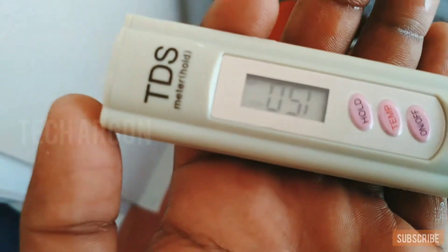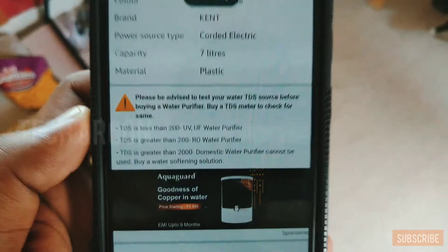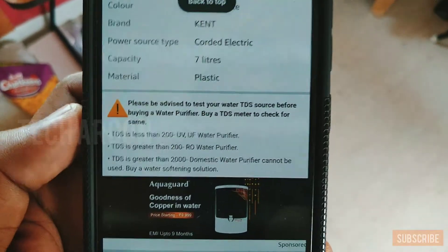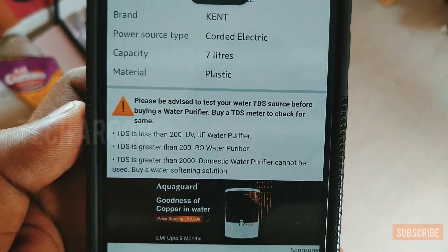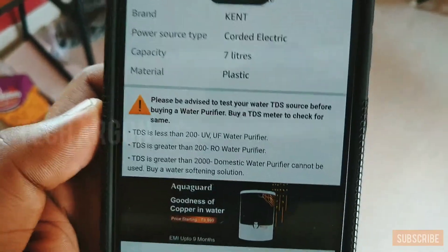Now we can see the TDS of my water is 150. If the TDS is less than 200, you can use a UV or UF based purifier. If the TDS is greater than 200, you have to use a RO based purifier.